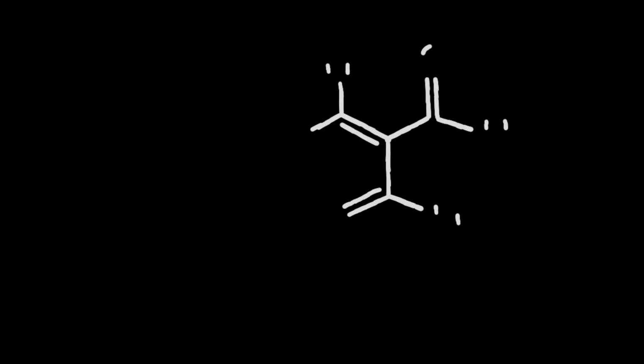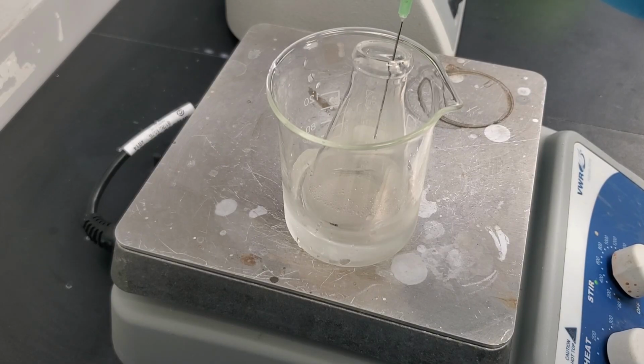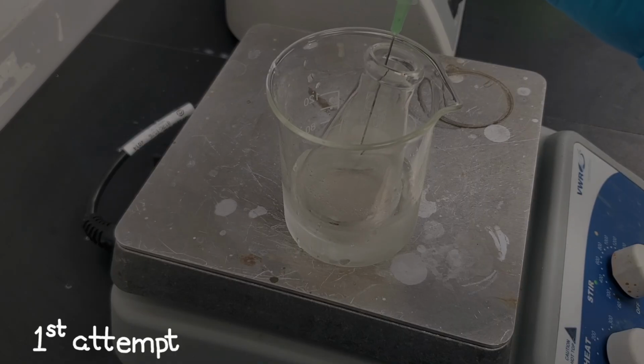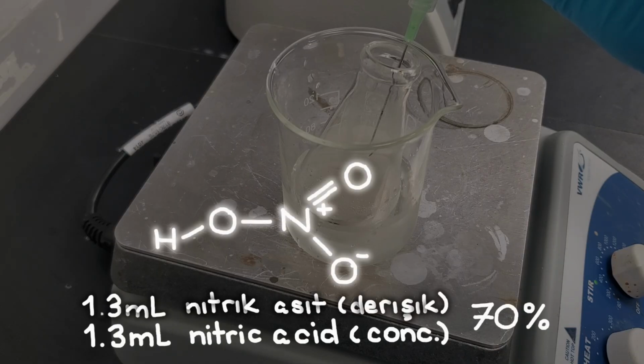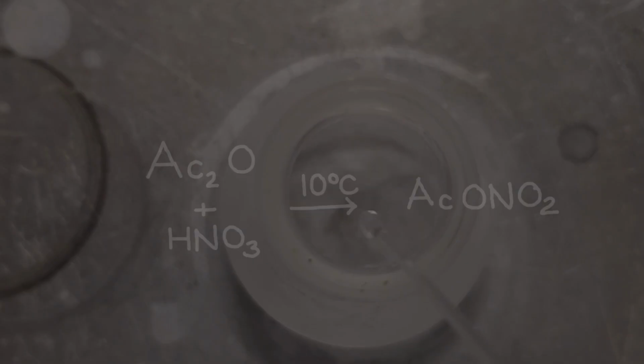Hello everyone, today I'm making 5-nitrovanillin, a useful and versatile nitroaldehyde building block. In my first attempt, I charged a small flask with 5 ml of cold acetic anhydride in an ice bath, then added 1.3 ml of concentrated nitric acid dropwise over about 10 minutes to generate acetyl nitrate in situ.